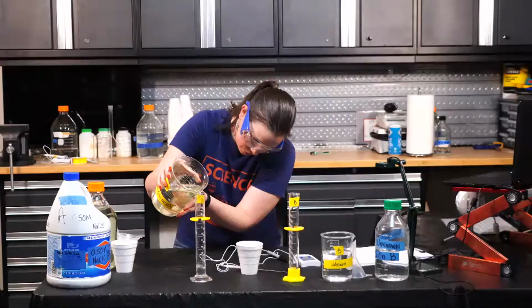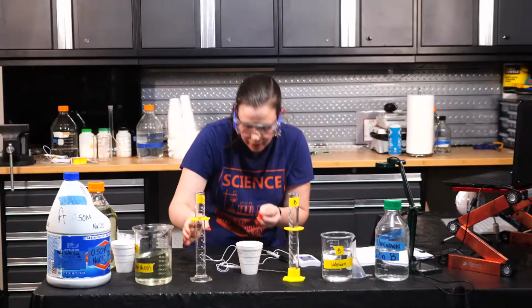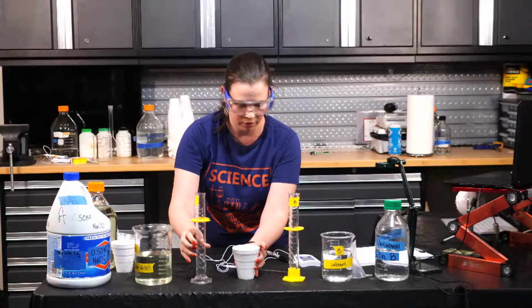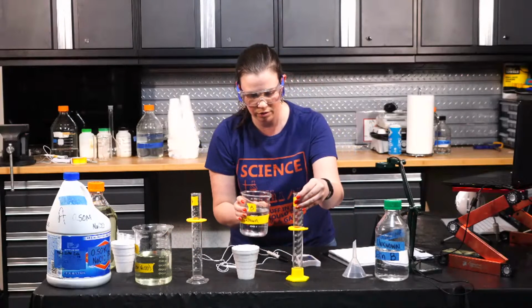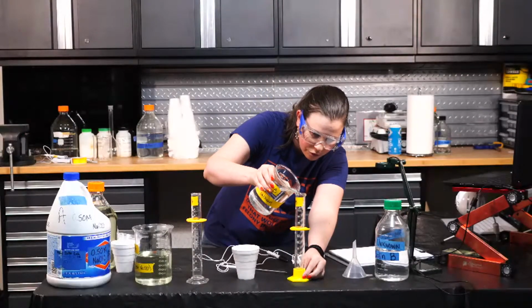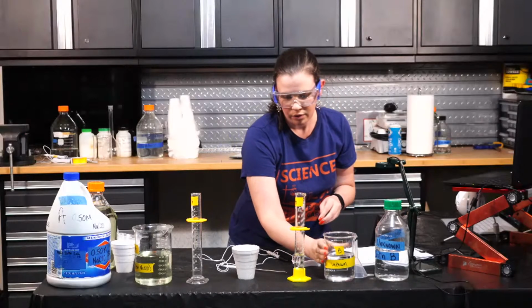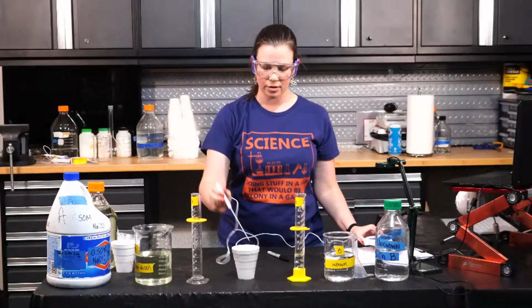And to be honest, I should really measure 15 milliliters in a 25 milliliter graduated cylinder, but that I don't have. So here's my 15 milliliters of bleach, and I'm going to mix that with 35 milliliters of unknown B for level 2. All right, and when I do, I want to see what the actual temperature is.